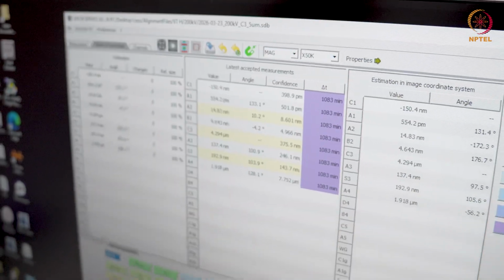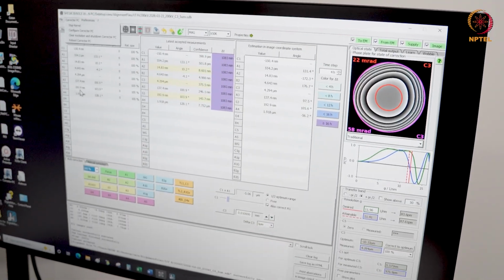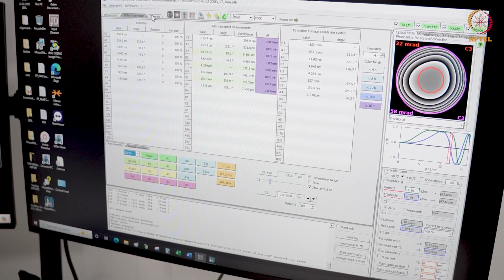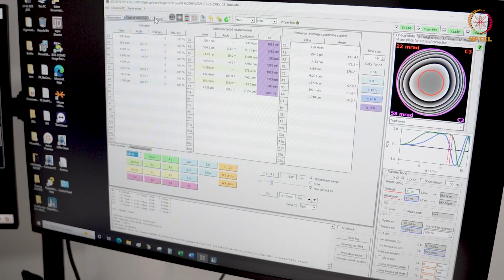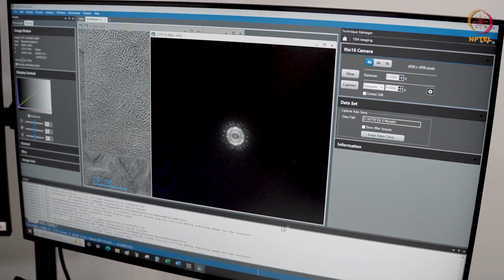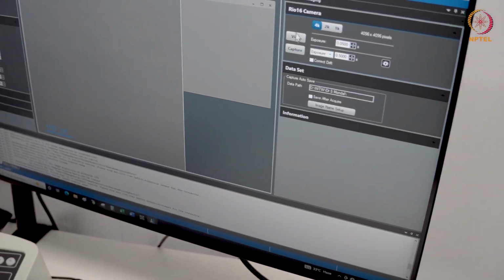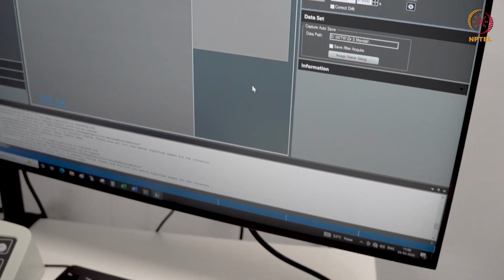Now because the corrector is in a healthy state, we'll not go there, but this is just to give you information on when you're requested to reboot the corrector PC. First thing is you try to reboot it remotely. If this doesn't work, you can then go physically to the ATCore power supply panel, and you can reboot the PC from there. And then the next software is Gatan Digital Micrograph, which is shown here. You go here and choose the TEM imaging, and this is to control and capture the images that are recorded on the microscope.